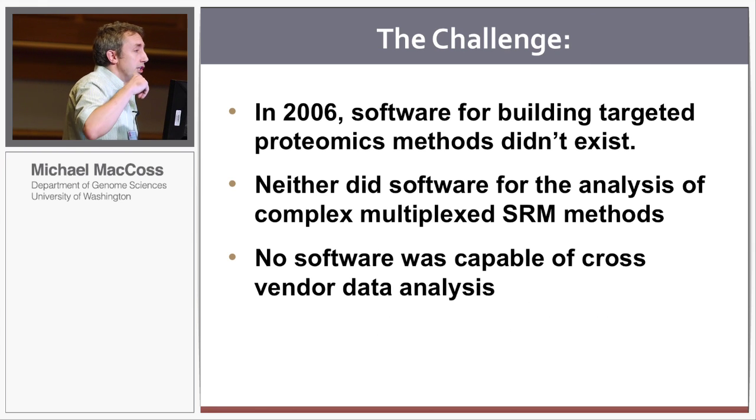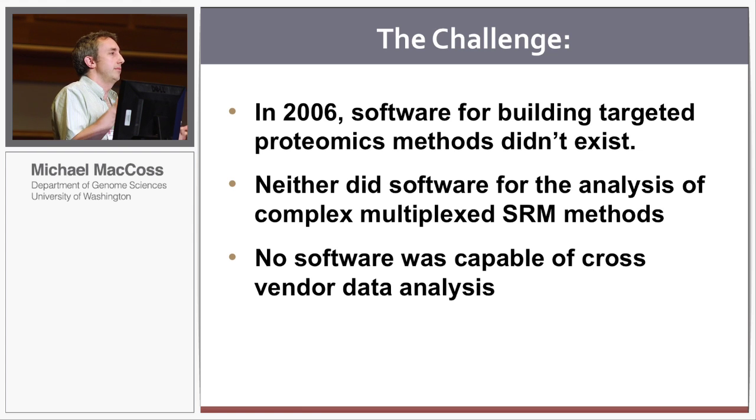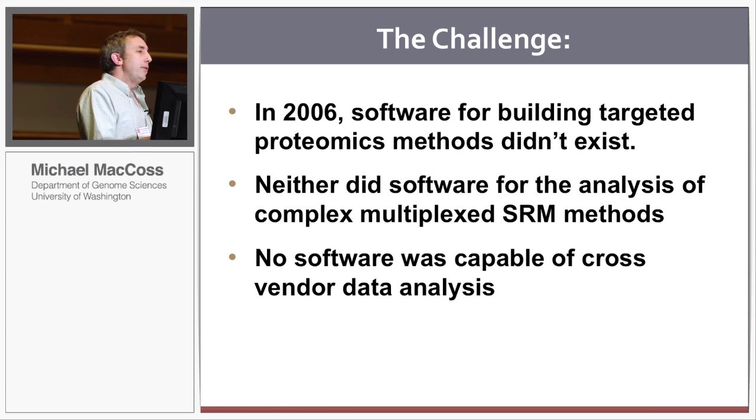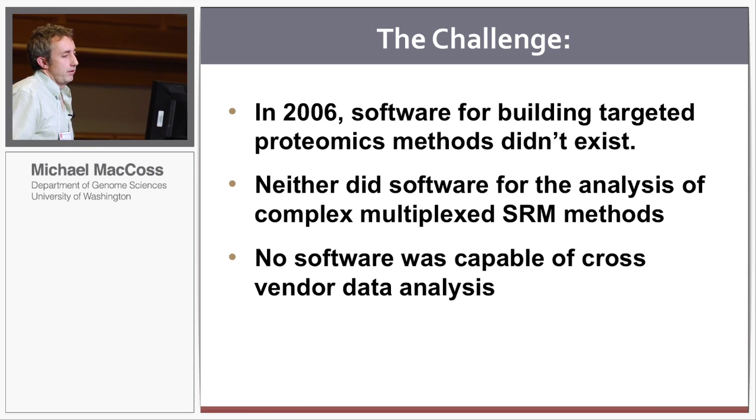Okay, so I had already convinced myself that it is very important to measure things in a targeted way. Collaborators often come to us and say, do this enormous proteomics experiment. The first thing they often say is, how come these 5 proteins I know a lot about in my system aren't in your list? So it began to make me think, well, maybe we should start with those first 5 proteins and come up with assays to quantify them first.